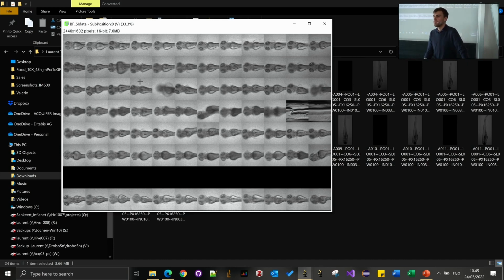I have one question. Are you planning to implement it such that it will not have this black line, but basically see, okay, it is 12 wells, so you can do, I don't know, 6 times 2 or 3 times 4? Yes and no, because I want to respect the plate layout, because you can go back to your data and say, okay, that's really like A2, something like that. What I'm doing, I'm adding basically the well number on the image as a label. Ah, yeah, true, I could do that. For the paper, actually, yes, it looks cool, but we want to line it up. Yes, it even looks cool as well.